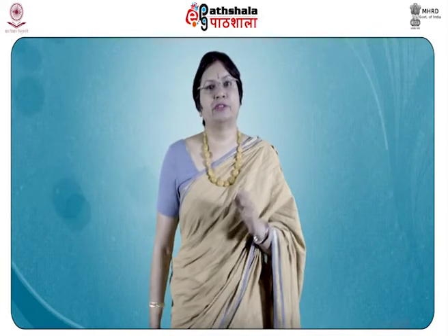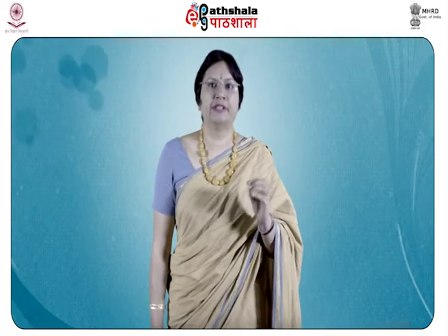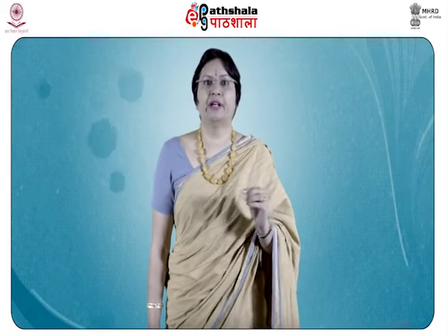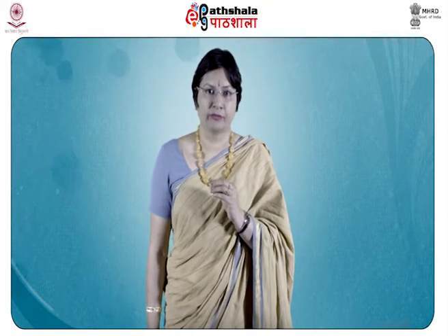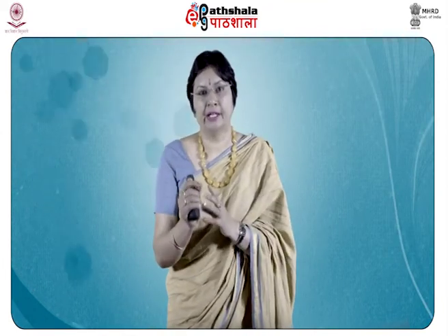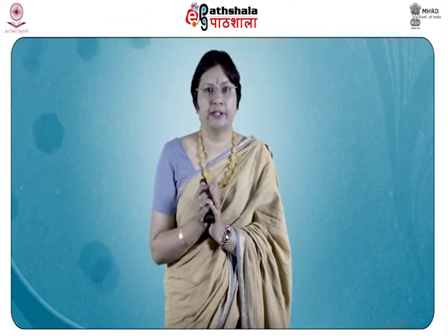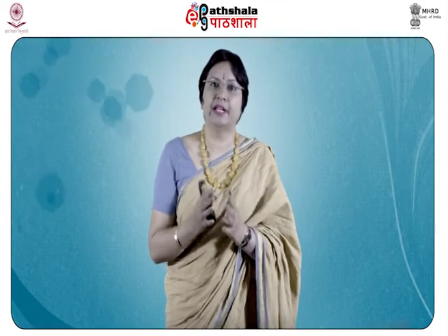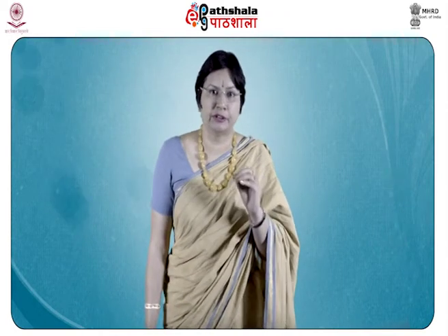Tests for explosives are carried out to detect and identify the ions present in the explosive material. The test must be carried out along with the reference standard as blank. So, when you are in a forensic lab, you take a known cation, carry out that test, and the evidence or the sample you have collected from the scene, also you conduct the similar test and just compare that, which will be guiding you whether the test is positive or not.